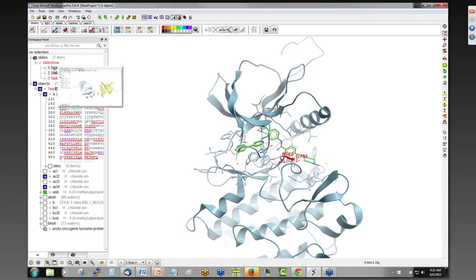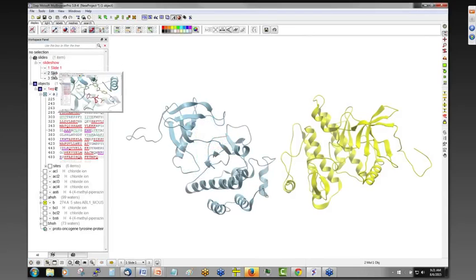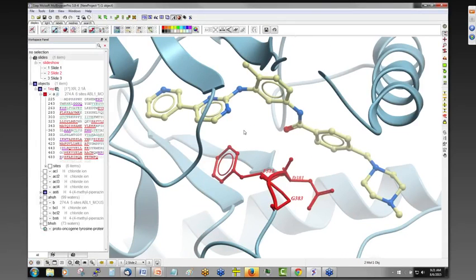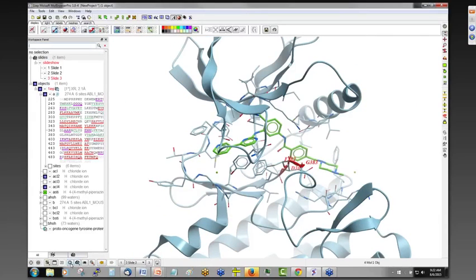Okay, so now if we toggle through the slides, we get a bit of different effects like that. Also, if we like this picture, maybe this one might be more useful, we can save it as an image. We can click on this button here. If you click it once, it will copy the image to clipboard. It's quite a big one for the structure, but you can also write the image out if it's too big. That'll write it into a file.